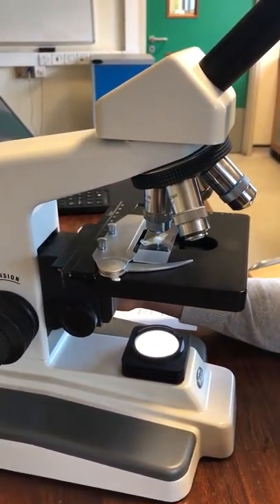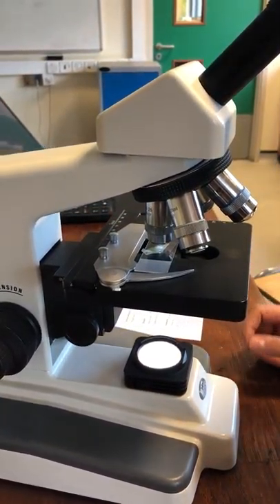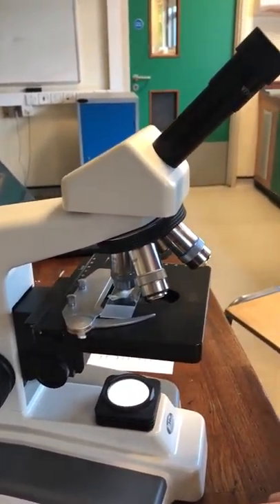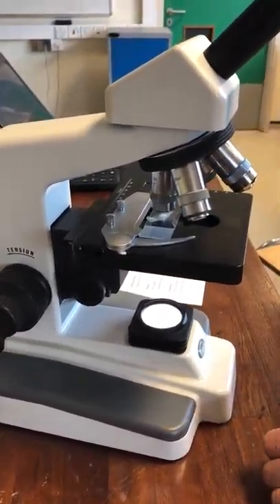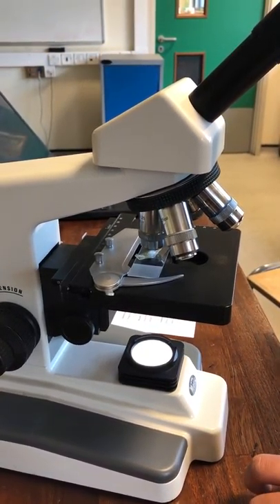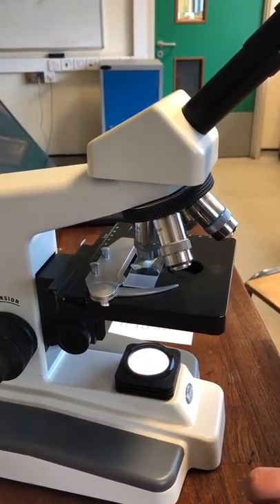That's pretty much it. When it comes to working out magnifications, remember to multiply your eyepiece by the objective lens below, because a lot of people add them up or subtract them, and it's quite an easy question to get wrong.